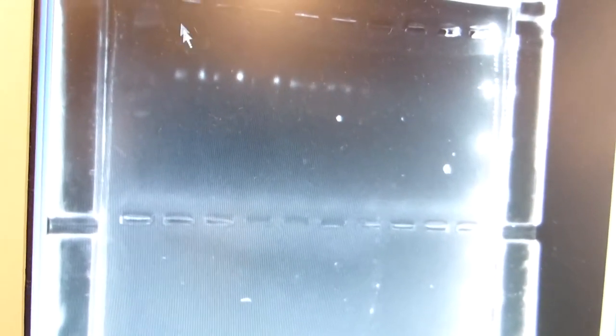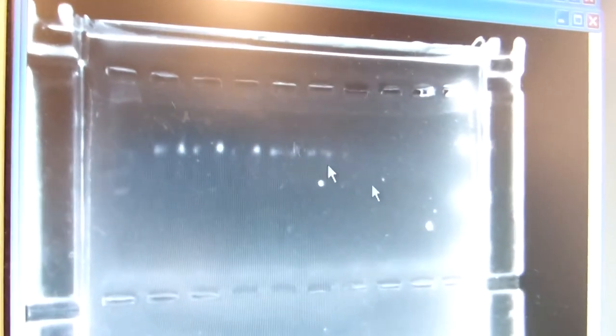Again, play with the setting until you are happy with how your DNA looks. This appears to be the best range for us as we can see the DNA and a bit of the ladder. Often times you will get clearer imaging of this, especially if you use more ladder. But this will work for our example today.